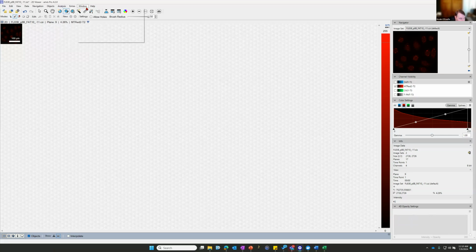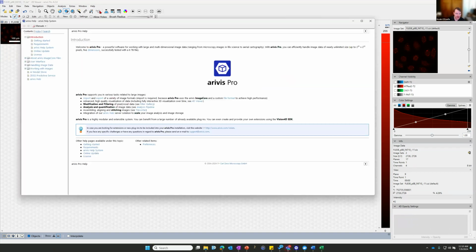Okay. And then if you have any questions, if you're trying it in your own hands, there are the manuals that we have here, as well as a help menu here. The help menu is the same interface as the manuals. So let's say I needed some help with this deep learning trainer. I would type that into the search bar up here.